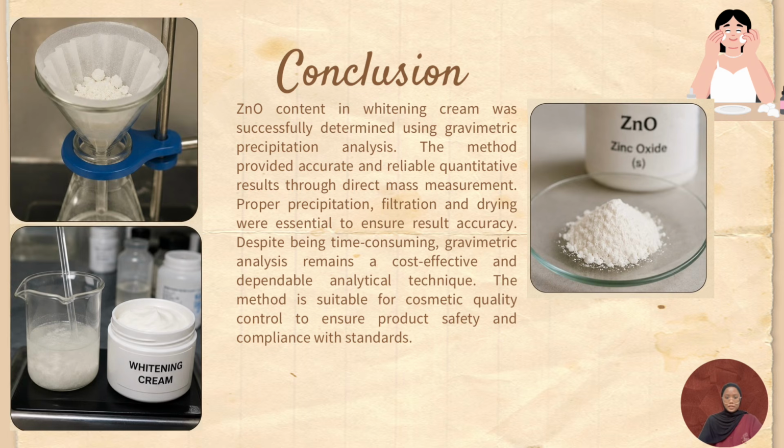Based on our findings, gravimetric analysis proved to be a dependable analytical technique because it provides accurate quantitative results while remaining simple and economical. Despite requiring more time and careful experimental techniques, it continues to play an important role in cosmetic quality control by ensuring that products meet the required safety and quality standards.